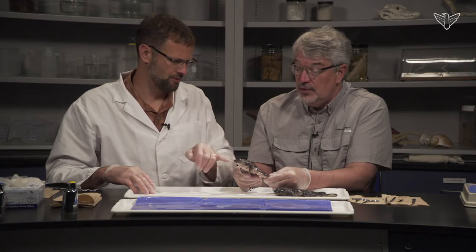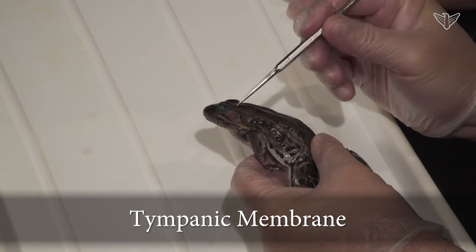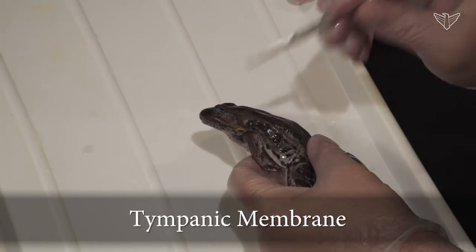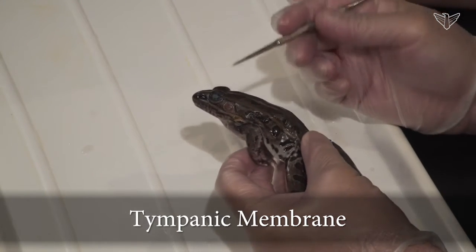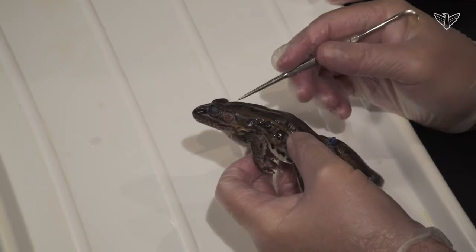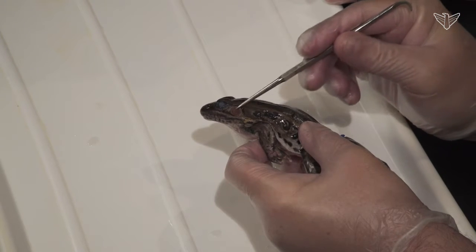Most notice right behind the eyes there's a little something. Oh, right, a little different externally. As you can see, there's a tympanic membrane right behind the eye, and we have a tympanic membrane too, our eardrum, as the name tympanic implies. And so this vibrates in response to sound waves. And so these animals are not only very good at picking up sounds, they produce sounds, as we know, for mating calls, territorial advertisement. And oftentimes the tympanic membrane is larger in the males than in the females, when you see that.